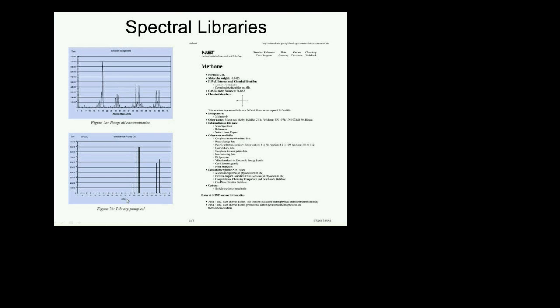So what I did was I went into the library and said, show me the spectrum for pump oil, for standard pump oil. You bring it up, and sure enough, the peaks completely overlap over the range that I measured. I would call this a match. I would say with certainty that these peaks are oil.